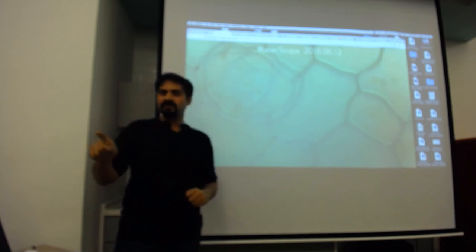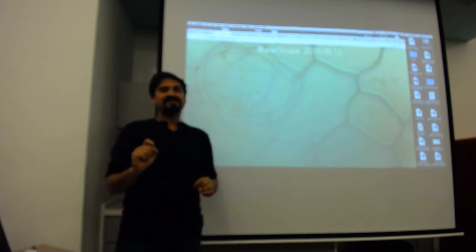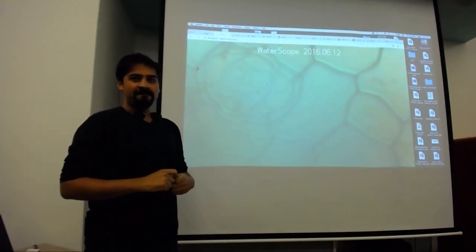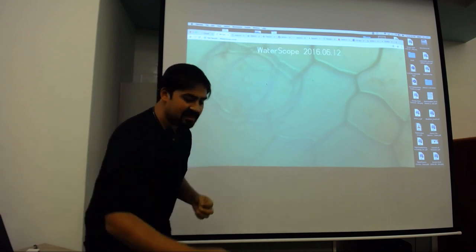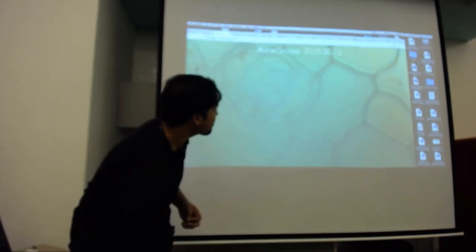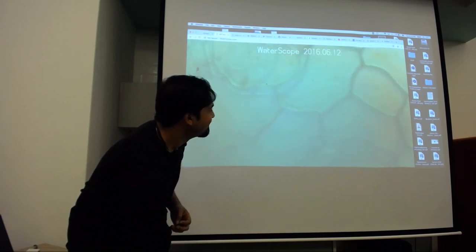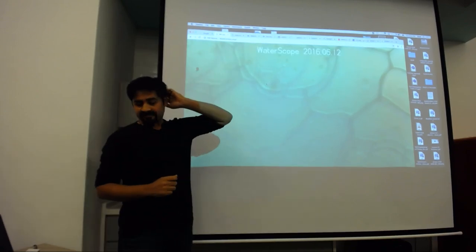So, do you see waterscope pi as a list? And yes, the password is waterscope. Not microscope, but waterscope. All right, as soon as you're in, tap on the thing and you should be able to see exactly what I'm seeing on the screen. And it's getting laggy already. What's the IP? 10.0.0.1? Yeah, 10.0.0.1.